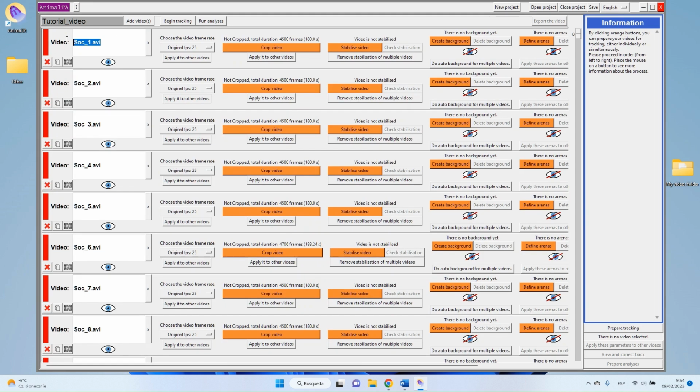As you see, for the moment, the name of the video is the name of the original file. But this name, very often, if you are using your video directly from your camera, will be very obscure and doesn't mean a lot for your experiment. So what you can do is just change the name of the video to something a bit easier to interpret.